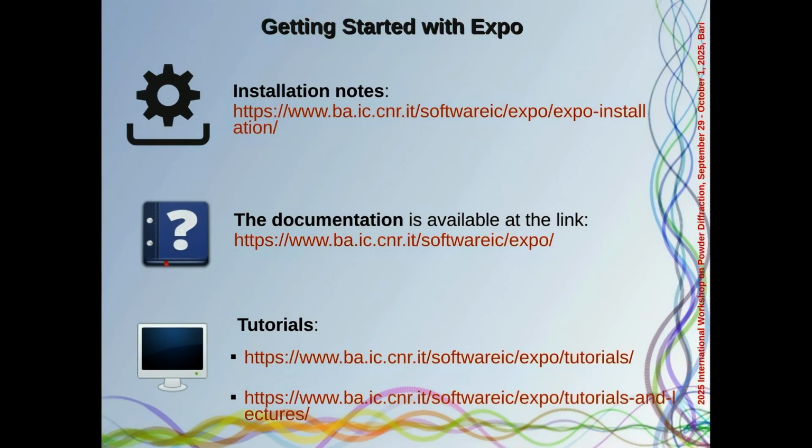In this slide you can find some useful links. This link contains the instructions for the installation. In the second link you can find the documentation and the reference to the main features of the program EXPO. And in the last link you can find some practical examples.